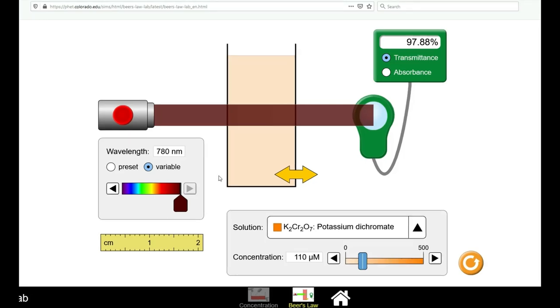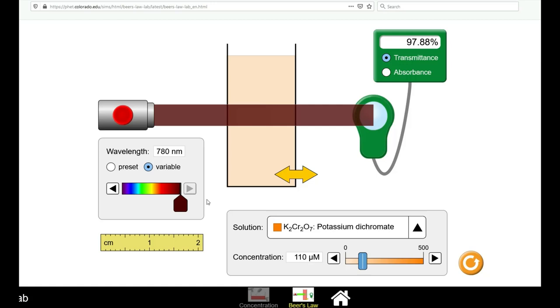Once you have recorded all of the data for your absorbance spectrum, you will be plotting this as a function of absorbance on the y-axis versus the wavelength on the x-axis. You will then use this absorbance spectra to determine what is the most appropriate wavelength to choose for a calibration curve. This would be the wavelength that has the highest absorbance.